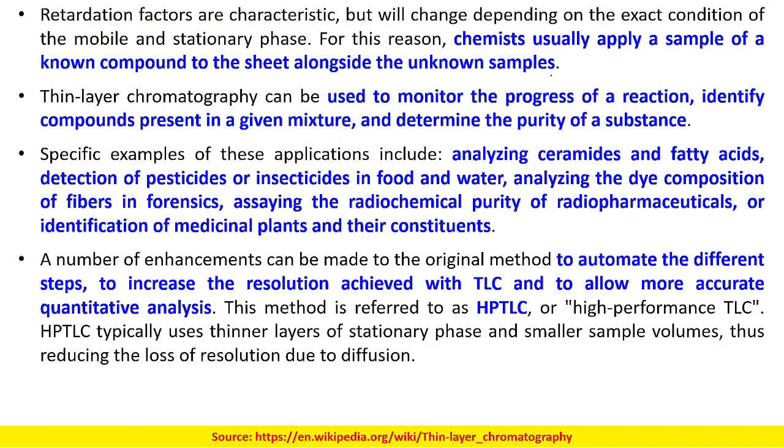Another important thing is that while we are performing the TLC, we apply a sample of known compound. Okay, suppose you are expecting a specific analyte A. If you want to see whether that A is present in your mixture or not, then what we can do, we can get the standard chemical and we can also run it parallelly.